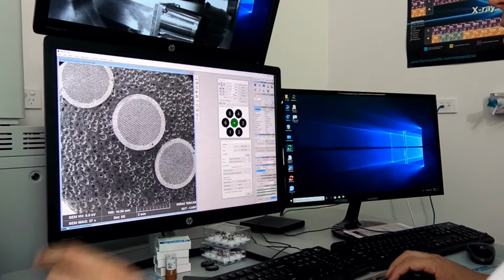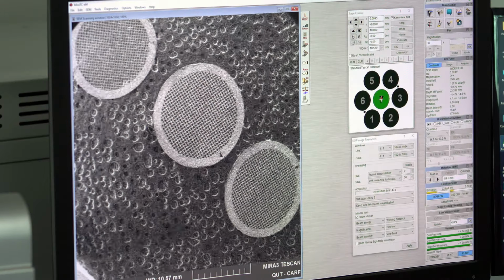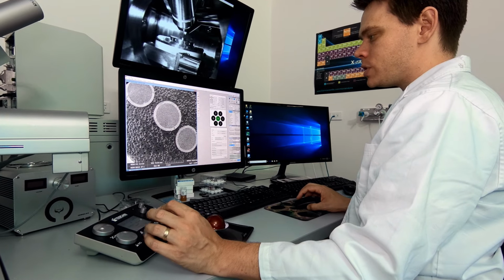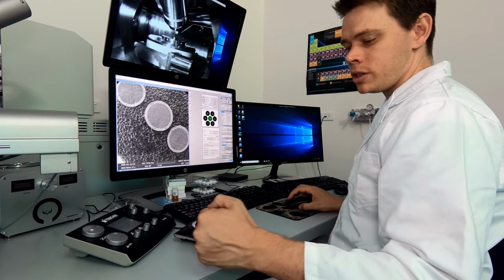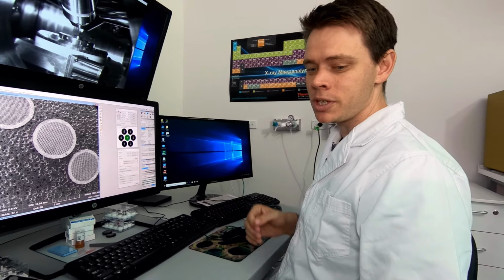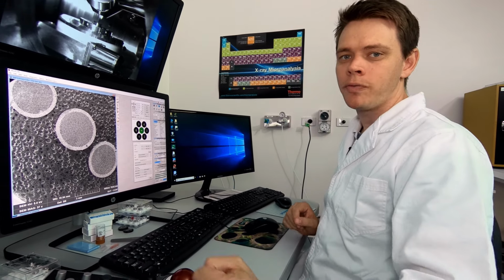We've got our 3 TEM grids, 1, 2, and 3. So we're going to have to do some exploring of our samples to find the nanoparticles and work out which ones are which. So now that I've focused on the sample, we're going to use the focal distance, which is pretty accurate from the microscope, much more accurate than the stage position.